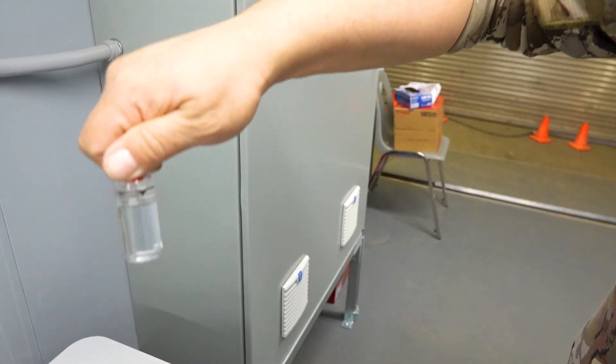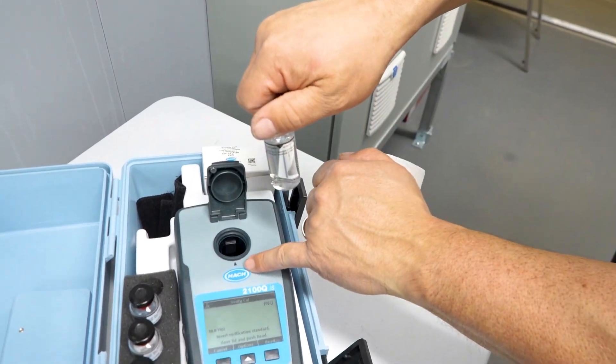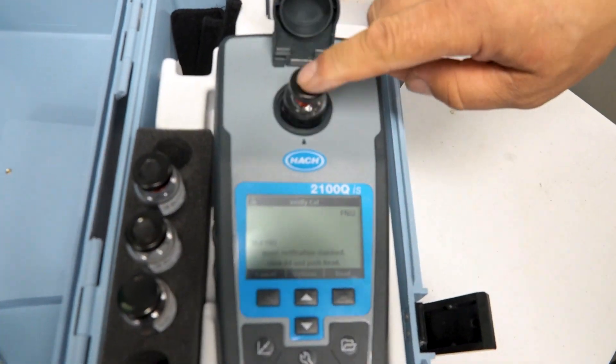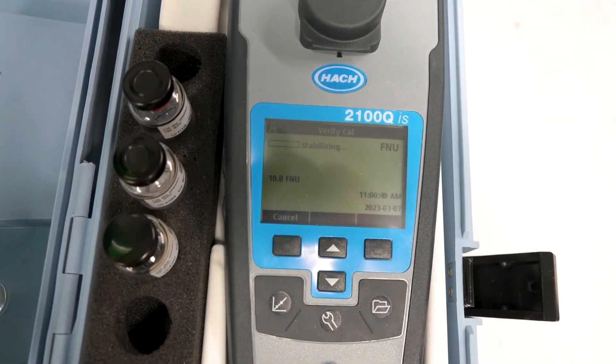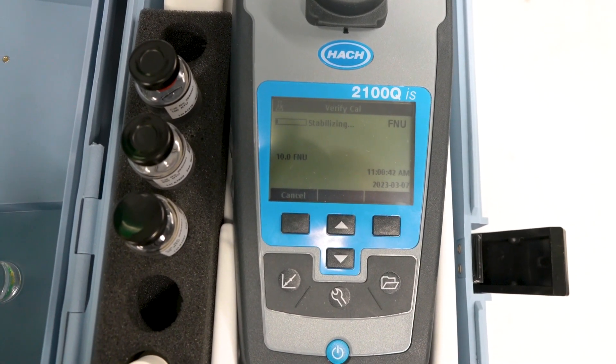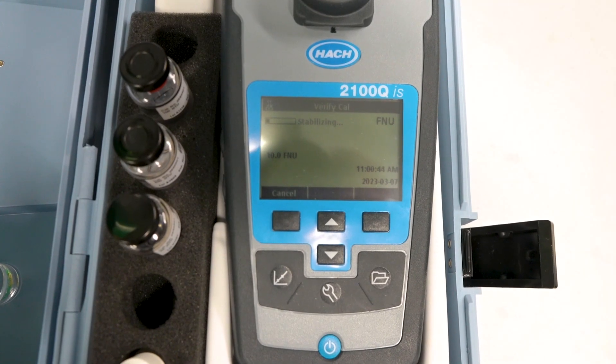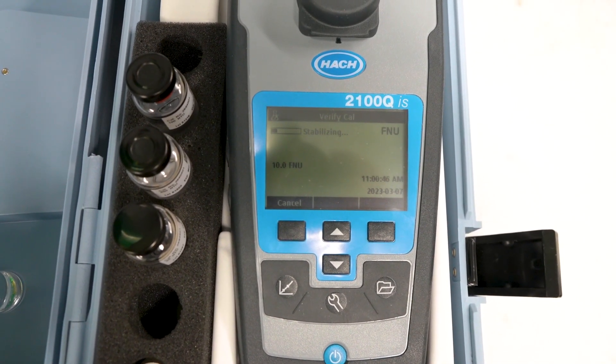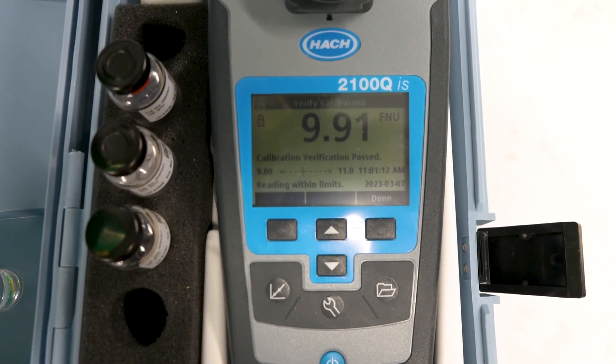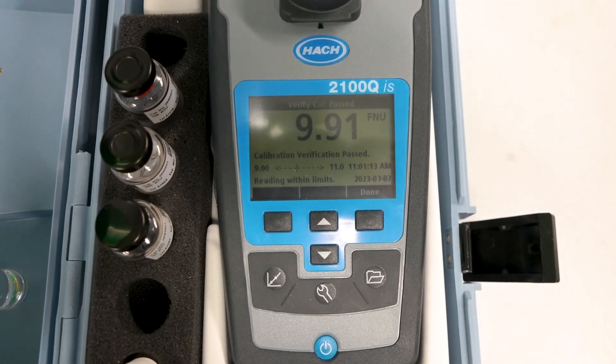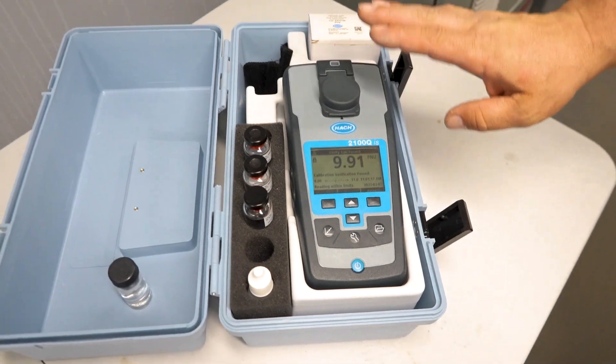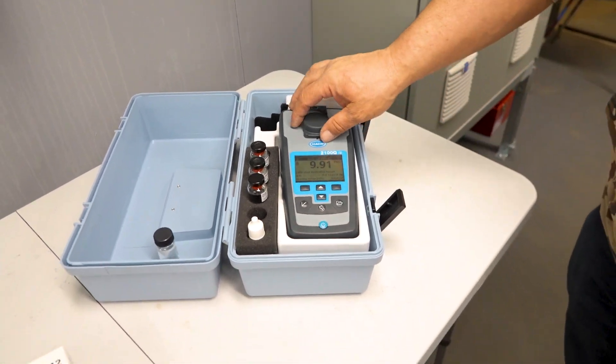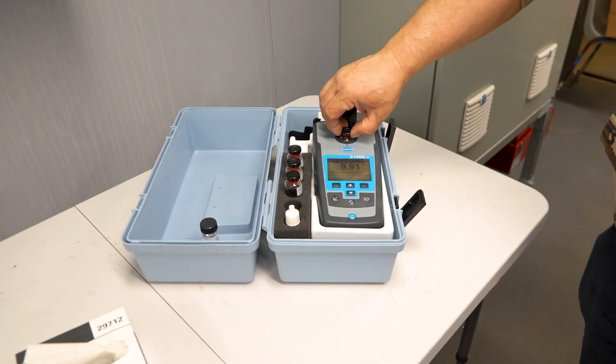Once it's mixed up, the same thing, arrow to arrow, push it in, close your lid, and then hit read. And this unit will tell you if it's within range or not. Seeing it says our calibration verification has passed, so in a normal situation you wouldn't go any further than this, but for today we're going to go through an actual calibration on the unit.